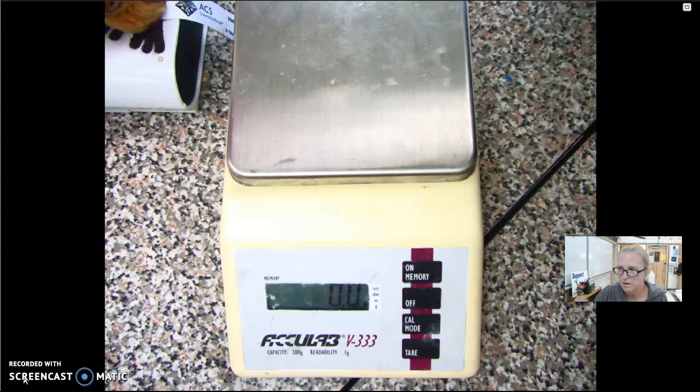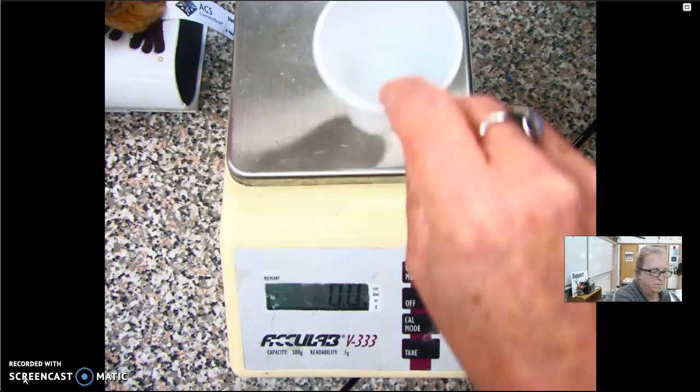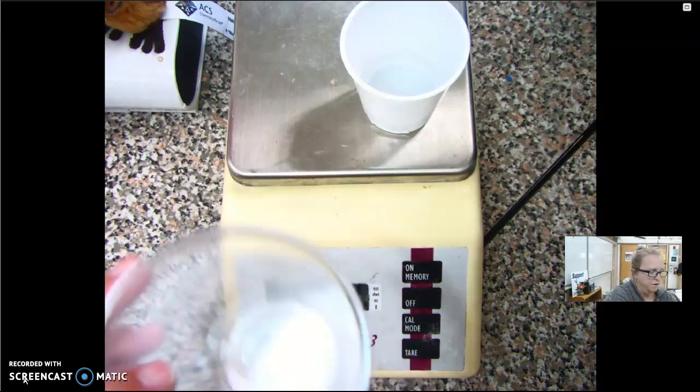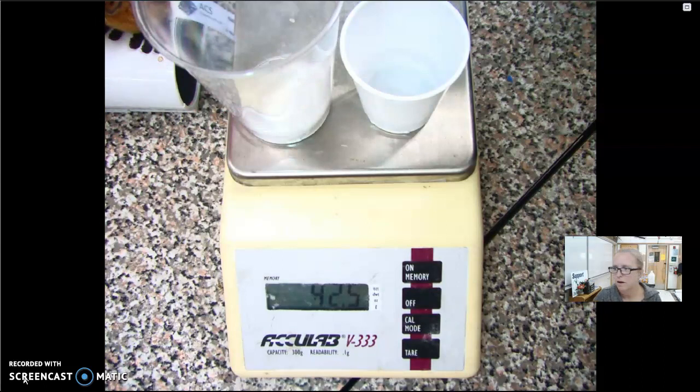We're in part 1. You should have the data table as well. You'll need that to record the masses that we are going to get to in a second. So we set the balance to 0. I filled the cup with about 20 milliliters, I actually measured it exactly, of vinegar, and it's right there. So it says put that there. And add 1 spoonful of baking soda into the other cup or beaker, and I've already done that right there.